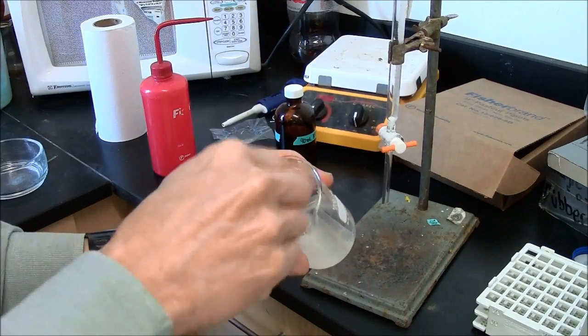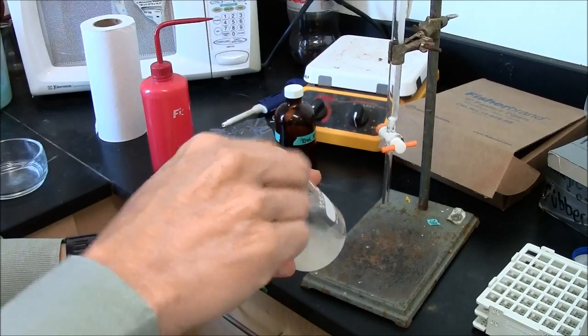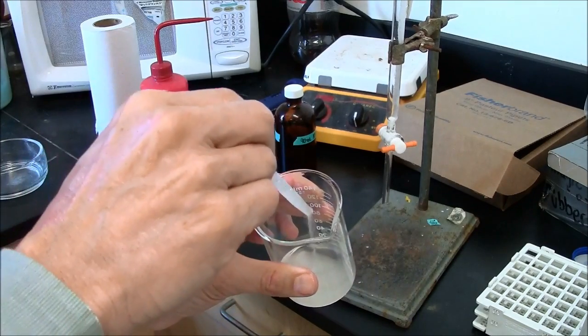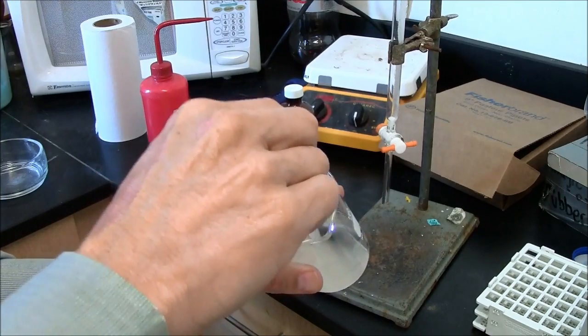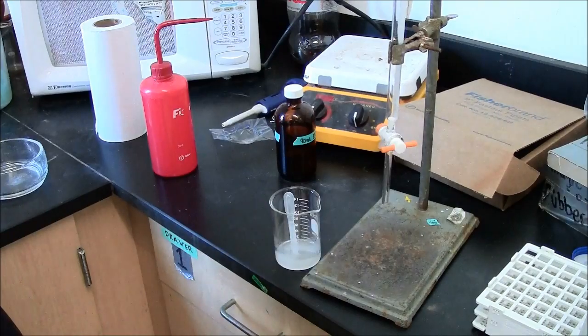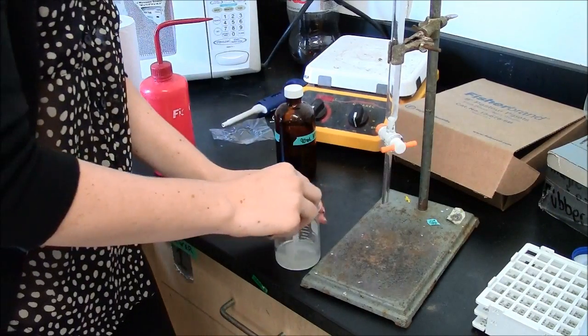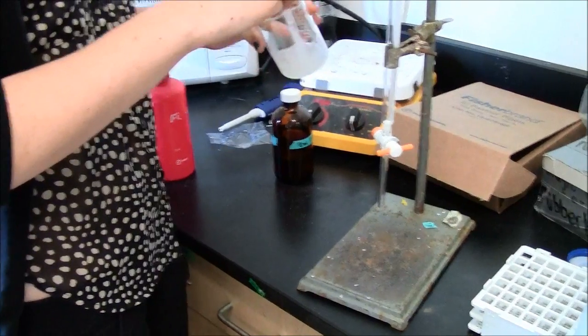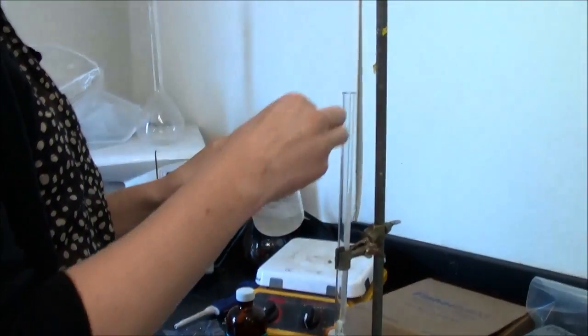This looks pretty good, yeah. So it's certainly slushy, it's not overly fluid. You can pull up silica in your pipette and you can deliver silica with some solvent as well. Yeah, so that looks just about ideal. And you do need to keep stirring it to get the silica suspended. Alright, so into the top that goes.